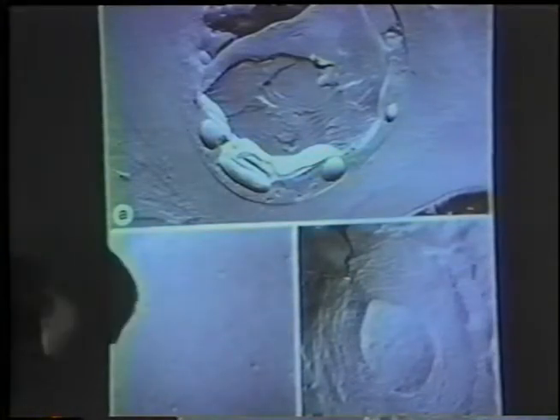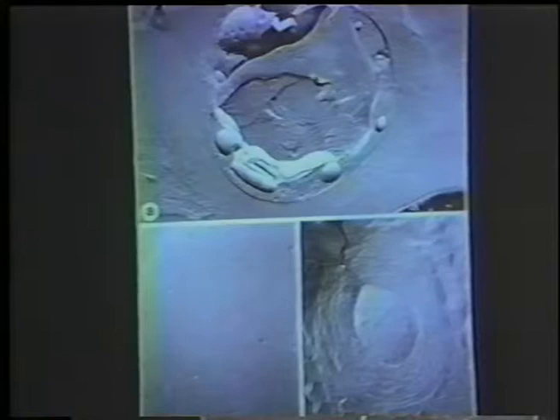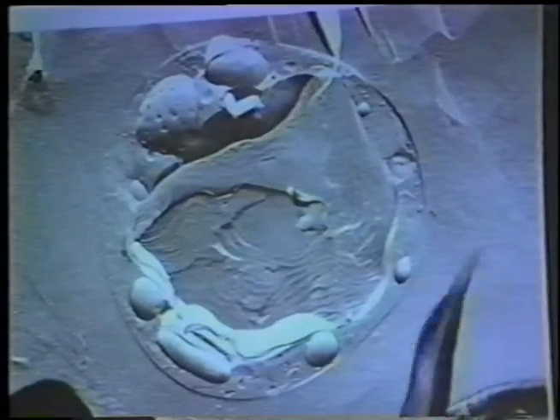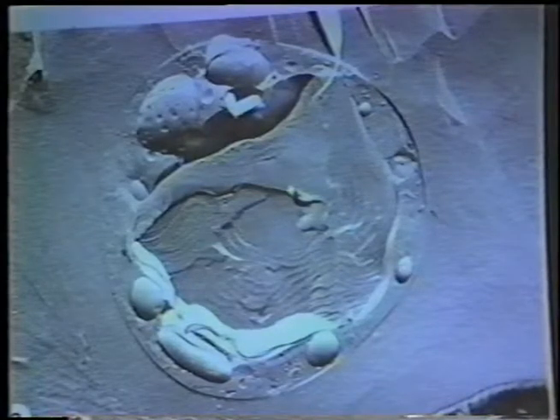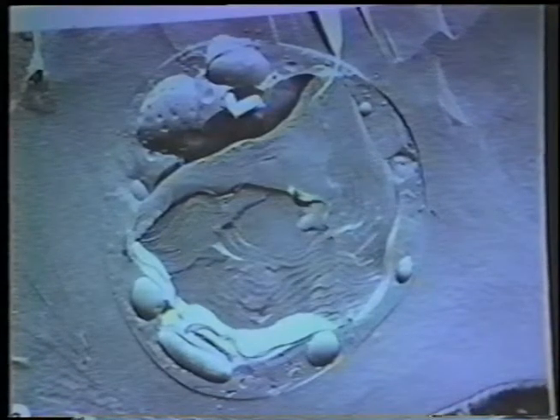Now, all the samples you're going to see here were frozen on the jet freezer, or one like it. This is the red alga, Porphyridium cruentum. It's a freshwater alga. It's very difficult to freeze well. This cell has been well preserved. The extracellular medium and the cytoplasm both show very fine granularity, indicating very tiny ice crystals. In fact, in this case, it's so small as to be at the level of resolution of this technique.